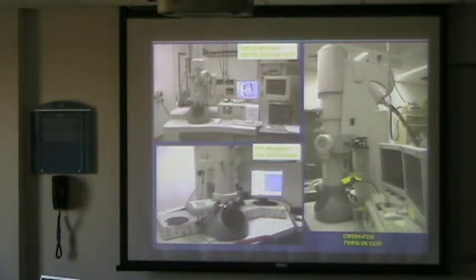We either have cameras which come in here, which act more or less like a wide-angle camera, like that one too, or we have cameras at the bottom, which is then a more precision camera. You can imagine the beam spreads, so the field of view up here is much bigger than the field of view down there, but obviously the resolution is worse here than it is down here. So it depends on the trade-off of what you want. If you want a high resolution, then you have the camera at the bottom. If you want a big overview, then you have the camera at this position here, the wide-angle port.